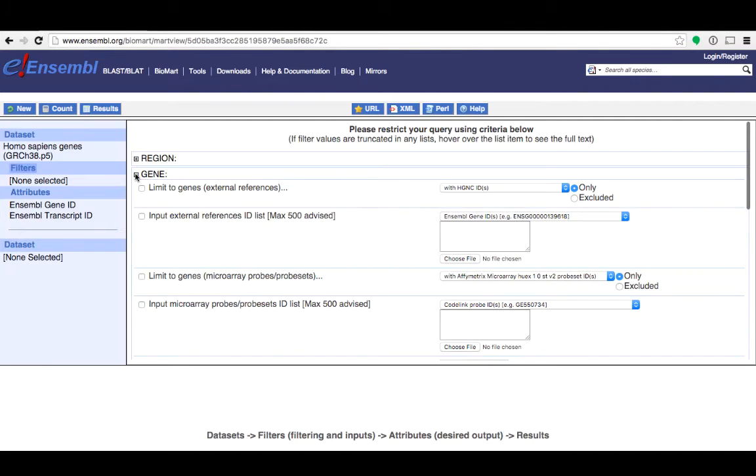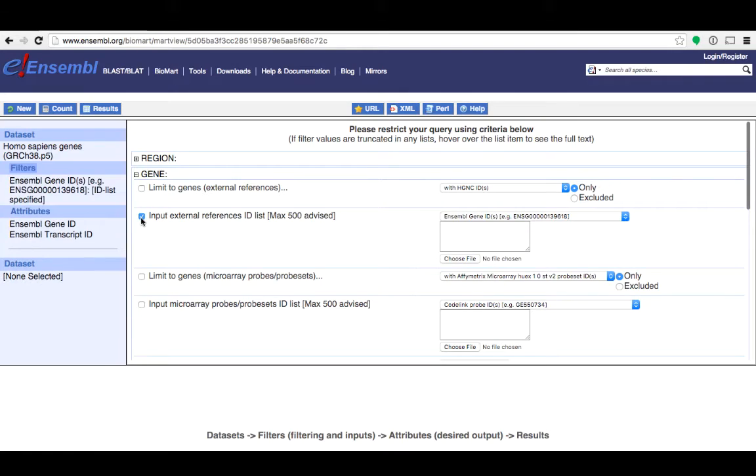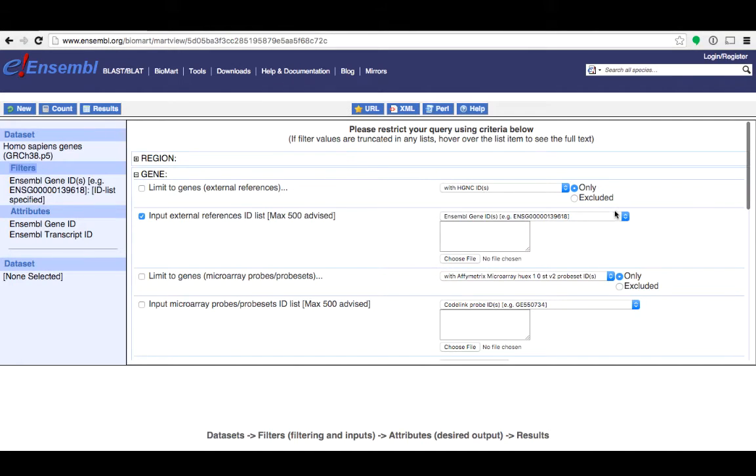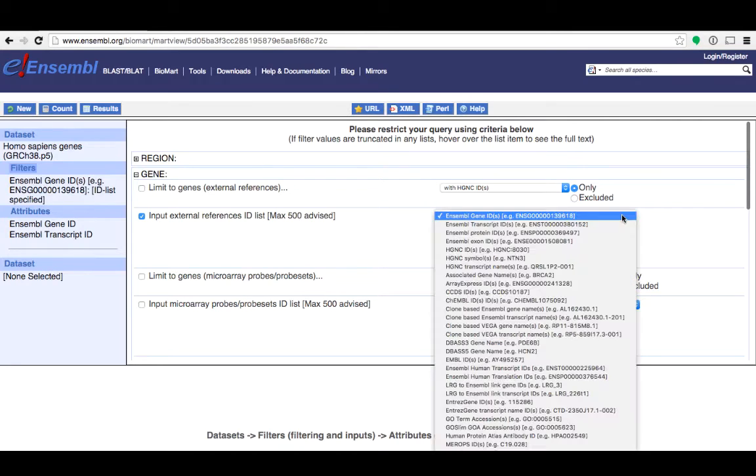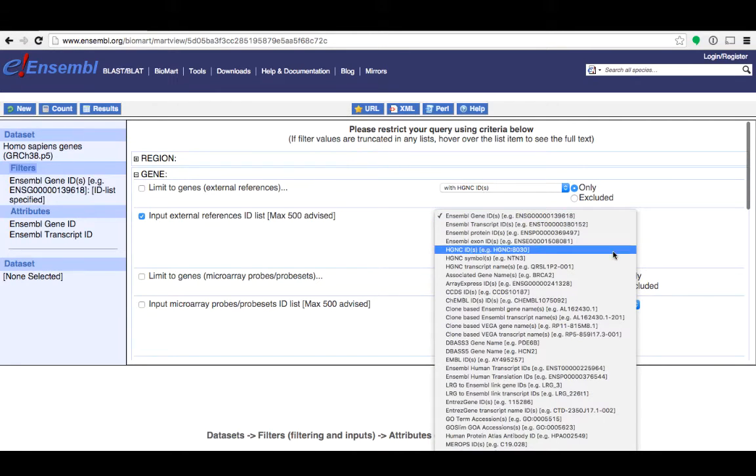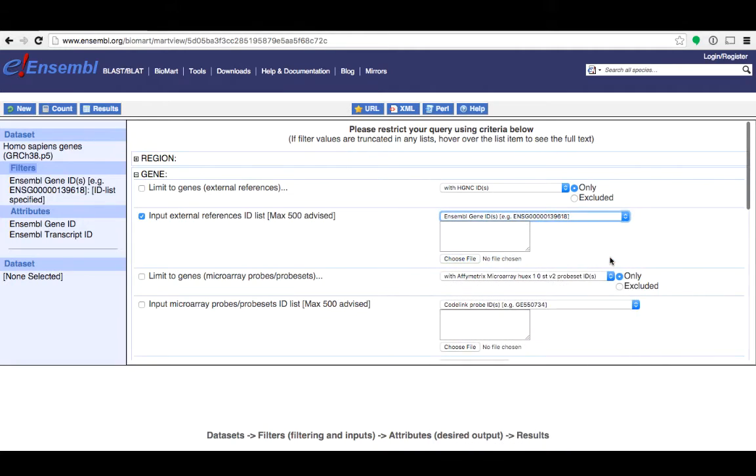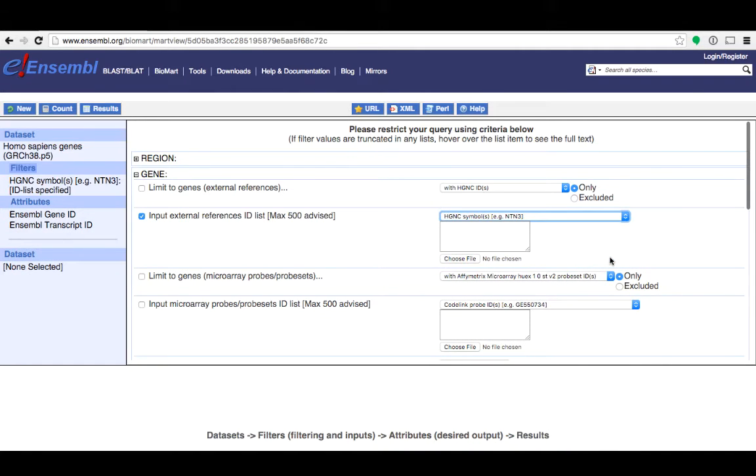Let's expand Gene. These are all the gene-centric filters that you can choose. You can filter to genes using their IDs. You can type your IDs into this box here or if you have a file with IDs in them you can upload them using this button. This drop down menu here lets you select the type of ID that you have. In this example I'm going to be using HGNC symbols and I'll paste them into the box.